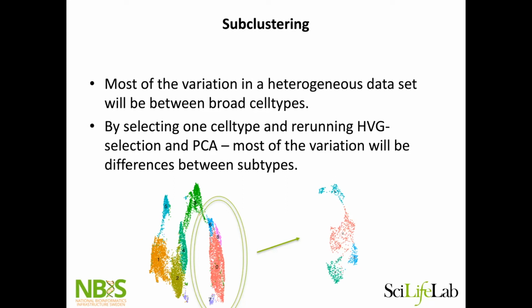Yeah, but for instance, if we say that now this cluster 0 splits into 3 smaller clusters, I would probably say that this is cell type A, subtypes A, B, and C, and then I would probably have them in different shades of red, because then you can actually take that annotation back to this big one and plot these in different shades of red as subtypes of this one cluster. Great. Something like that, I think, would make more sense. Good.